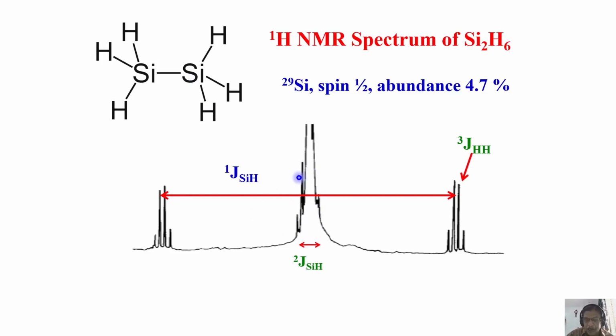You understand? You got the point. How to analyze the satellites, everything. How we analyze the satellite spectrum to derive the information which is not possible to extract from the proton spectrum. Okay, I am going to stop now.